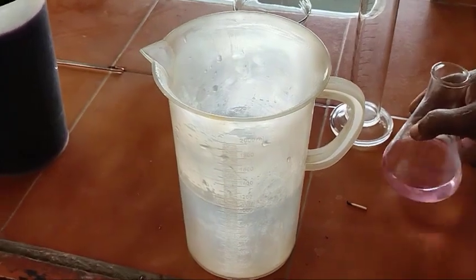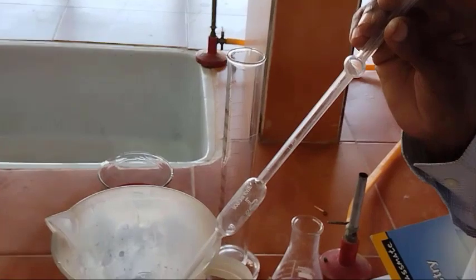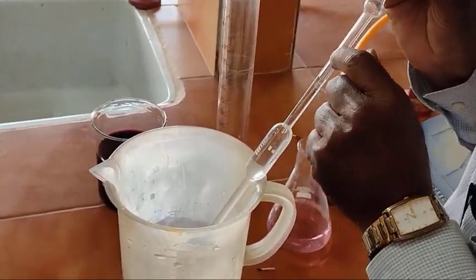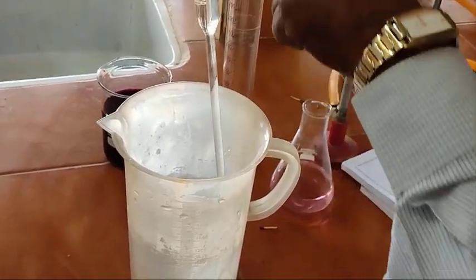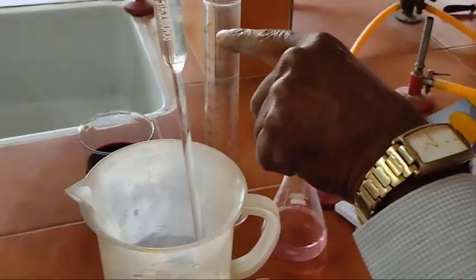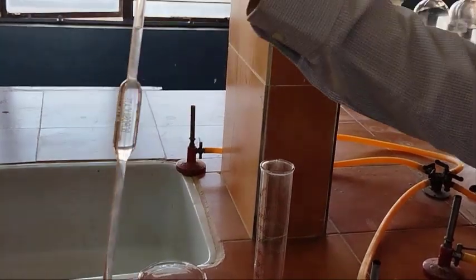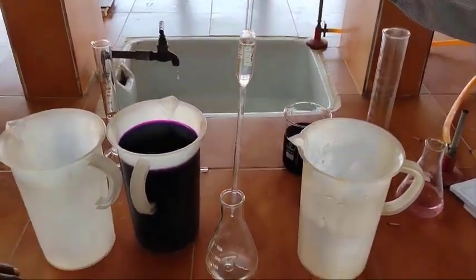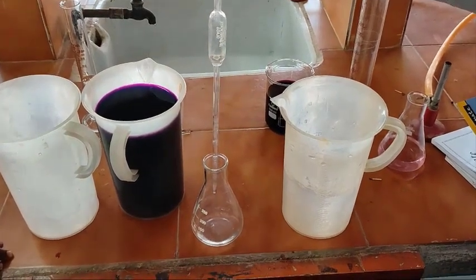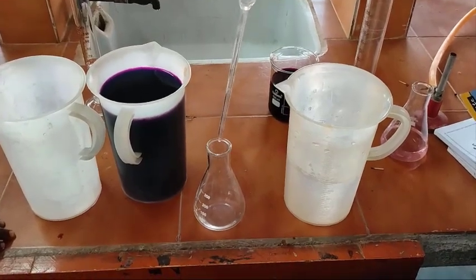Now, take the 20 ml of this one. This is the marking. Slowly leave it. Now allow this oxalic acid into the conical flask. Don't blow this final drop.